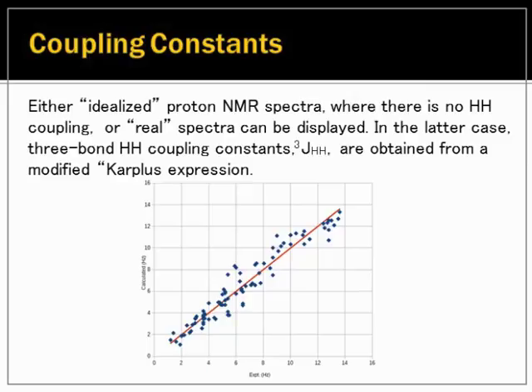Very recently, we've brought in the ability to actually calculate coupling constants. I'm not sure it's worth much. If I look at a set of, this is about 100 molecules, I think, experimental coupling constants versus empirical ones that we simply get from a modified Karplus kind of equation, just based on geometry, the correlation is actually pretty good.